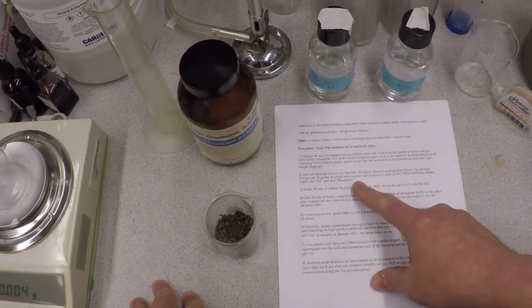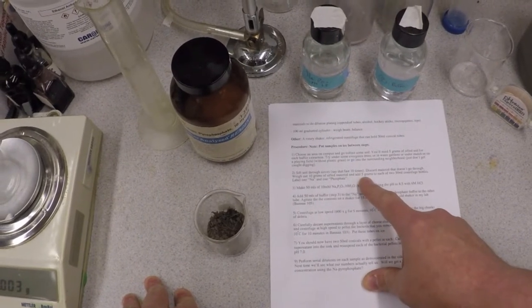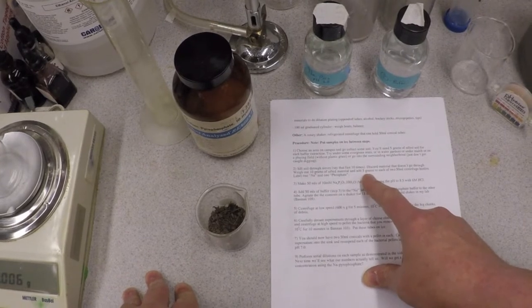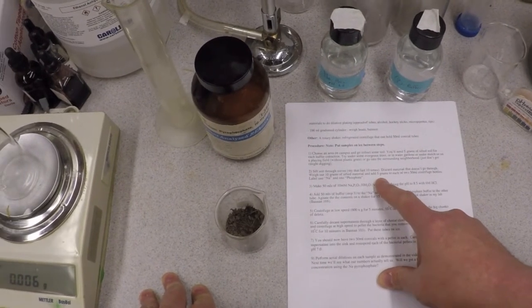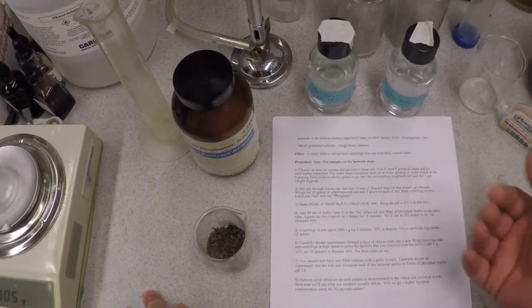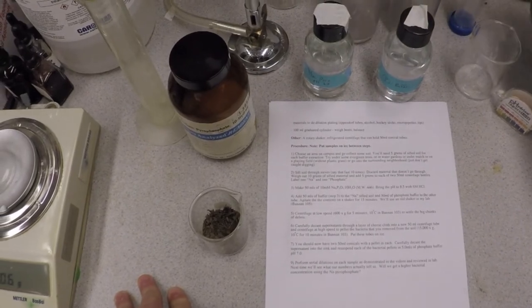You're going to sift it through the sieves. You're going to want to end up with essentially 10 grams, 5 grams in each of these bottles. One's going to be for sodium, one's going to be for the sodium pyrophosphate, one's for the regular sodium phosphate buffer.